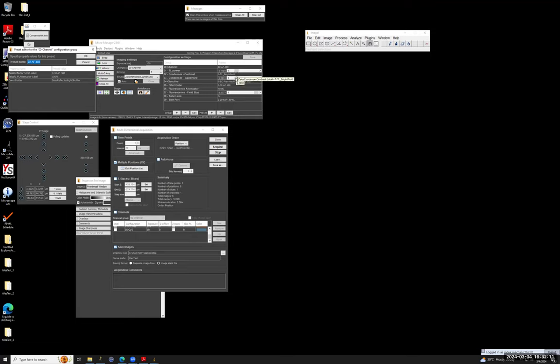So I set here the power of the lamp, I set here the aperture, and then while I do the fluorescence channels, it will not be affected by it, and it will apply always to the transmitted light channel. So it doesn't allow me to have multiple transmitted light channels with, let's say, different condenser aperture, with different transmitted light power, but that's not something that is typically needed.